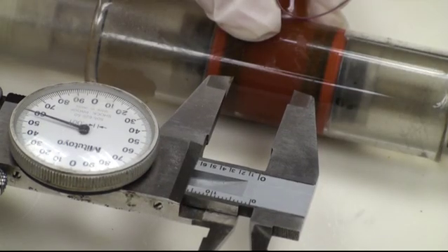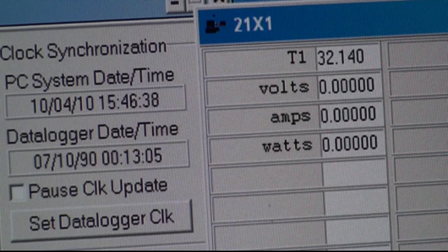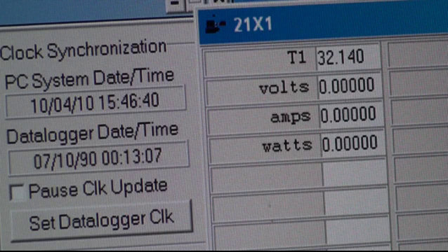Then we measure the length. Typically we want the conductivity as a function of temperature. To do that we use a data logger.